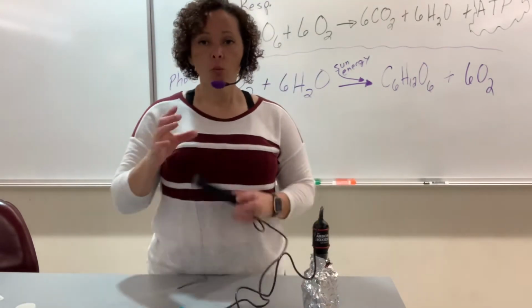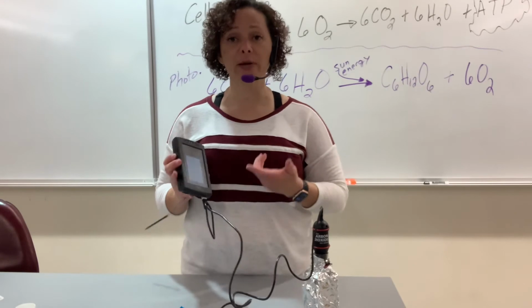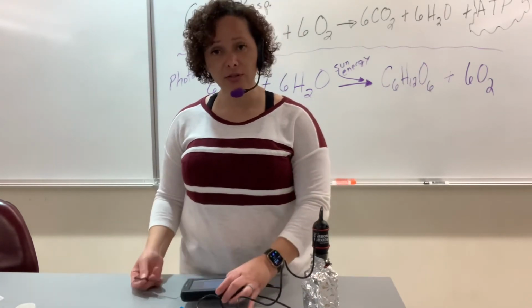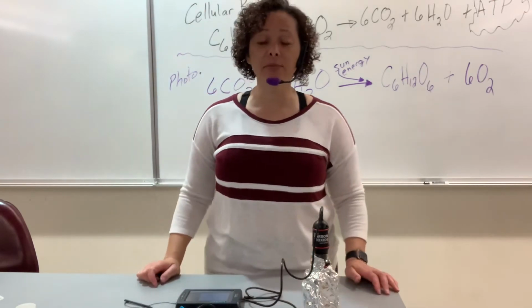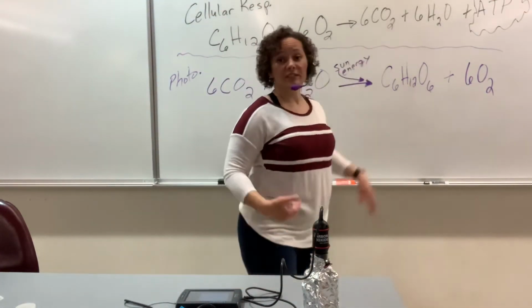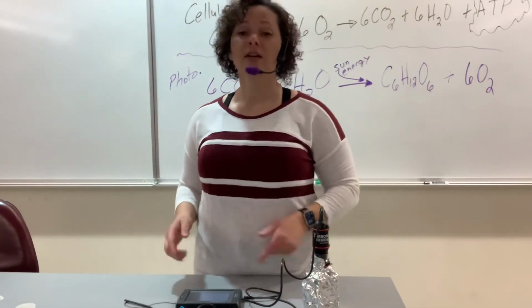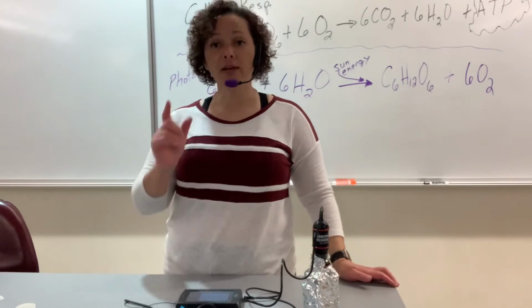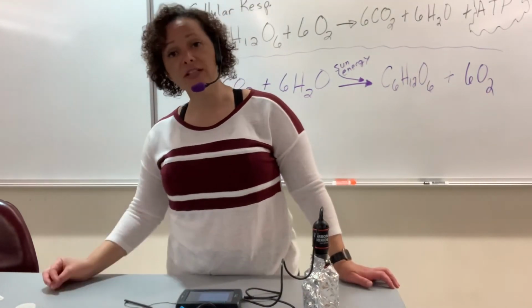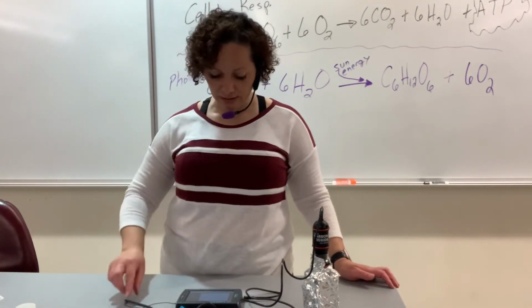Now, what this is doing, it is figuring out the respiration rate, the parts per million of CO2 gas that is being excreted over time. That is what the machine is doing. It's doing that for you, that way you don't have to do that. But you will have to use that in order to calculate that next step. And just hold on to that, I'll explain that.